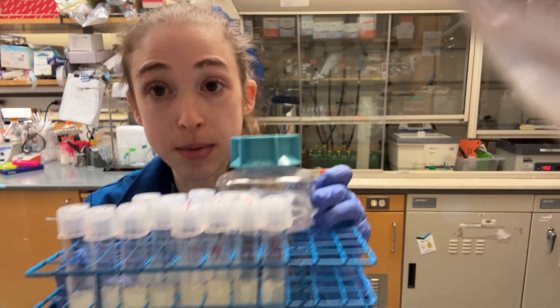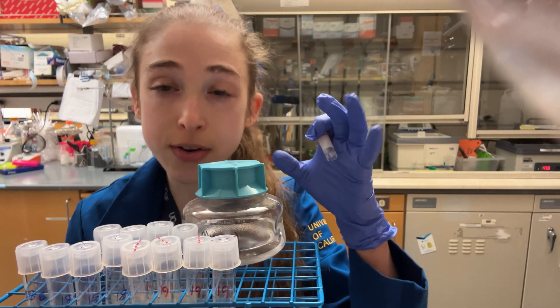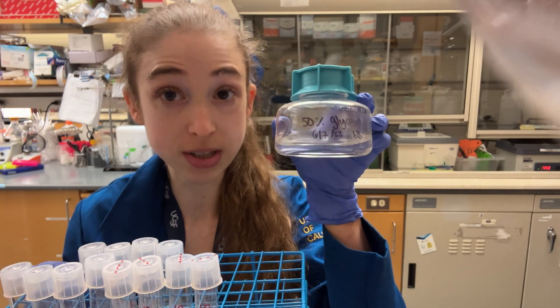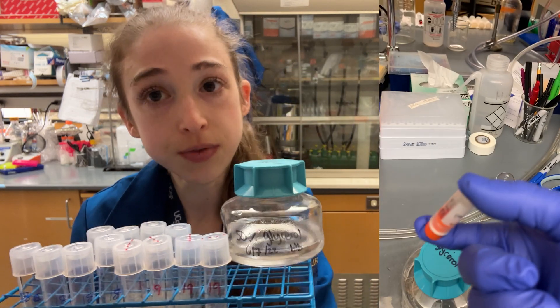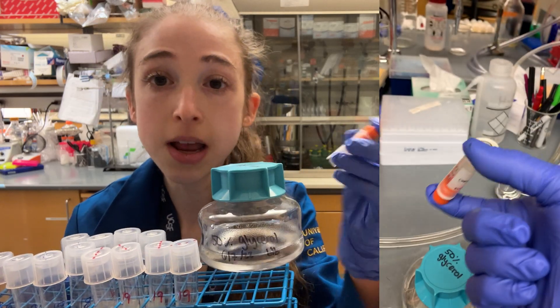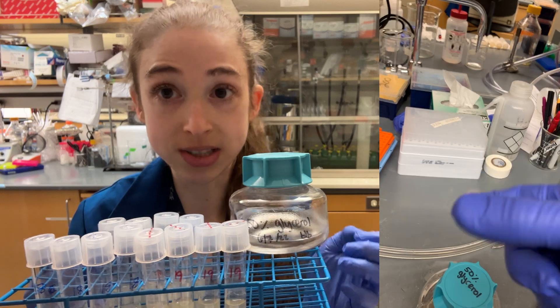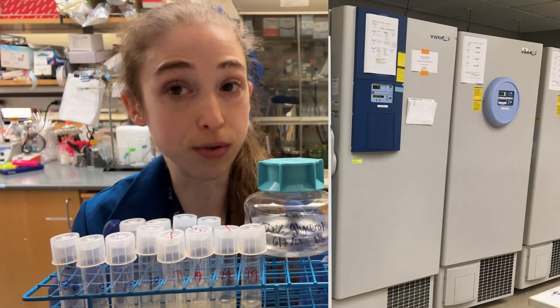All you have to do is take some of your bacterial cell culture — I typically do about 500 microliters — and mix it with some glycerol. I typically use 50% glycerol, so I have 500 microliters of glycerol plus 500 microliters of my bacteria. I mix them up and now I get a solution with 25% glycerol that I can freeze in the minus 80 and store long term.